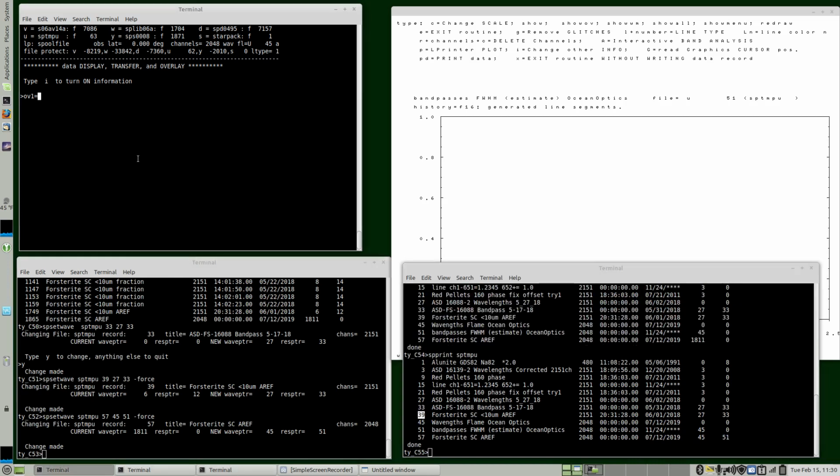So U39, U27, then OV2, which is blue, we'll do for the UV, U57, U45.